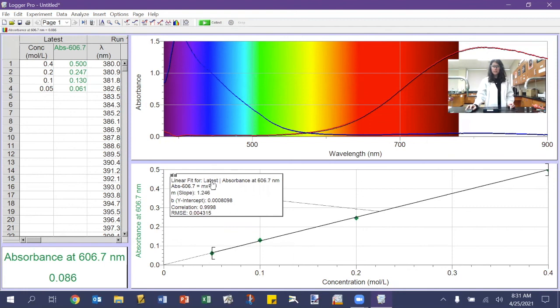And I'm going to use the equation here to solve for the percent copper in the brass. And so once I have that, now that will come out as molarity because that's how I entered in the concentration, but I can use the mass of the brass pellets to ultimately figure out the percent by mass of copper in those brass pellets.